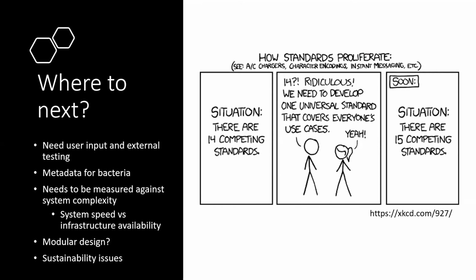One last consideration that we need to take into account is that we should not just have data for data's sake. And this concept of data minimization is becoming more and more important when legislative principles of data privacy are applying. This means that we need to have a shift towards data by design in our digital world.